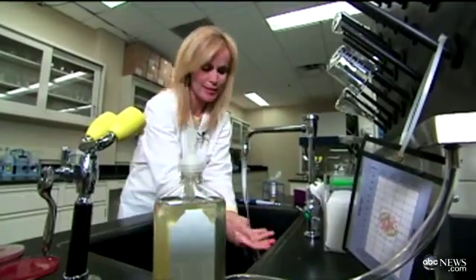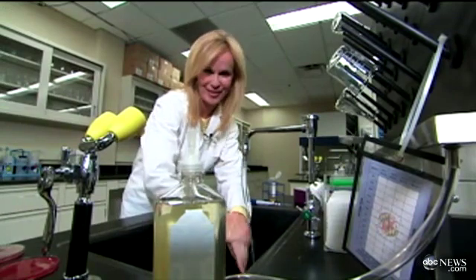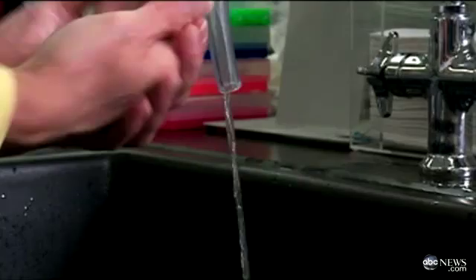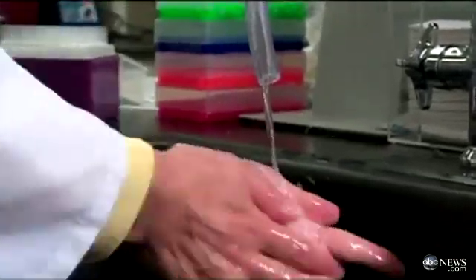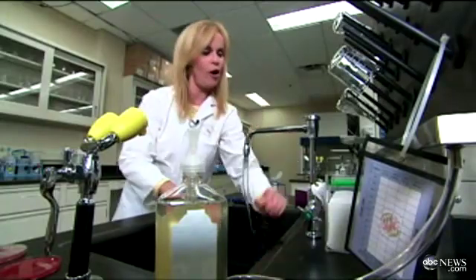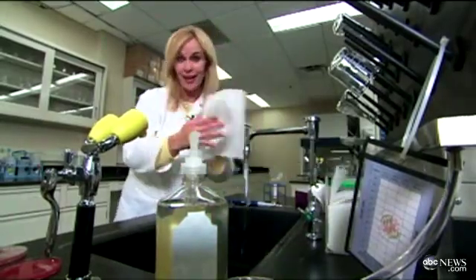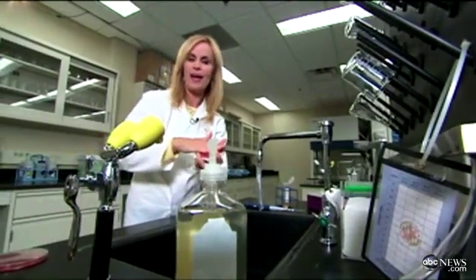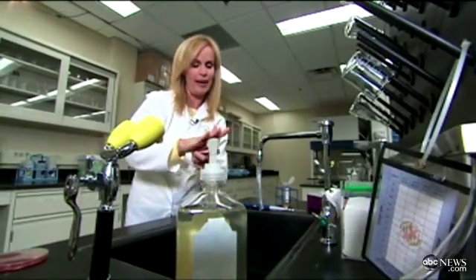Since I work for ABC, I always suggest singing your ABCs to reach 20 seconds. Be sure to get the backs of your hands, in between your fingers, around your nail beds, and then flip off the faucet with your arm. Dry your hands to get the last of the bacteria off. And once again, touch that plate.